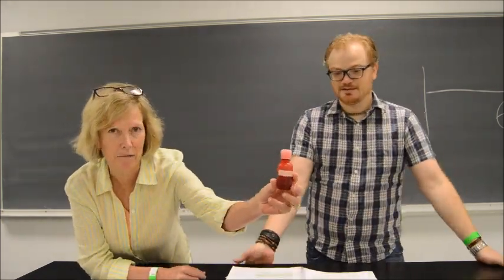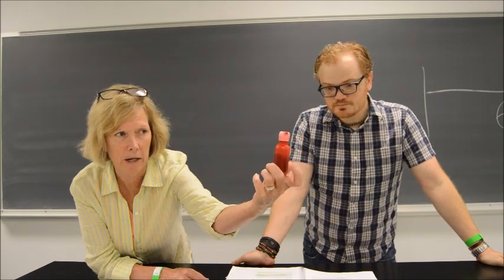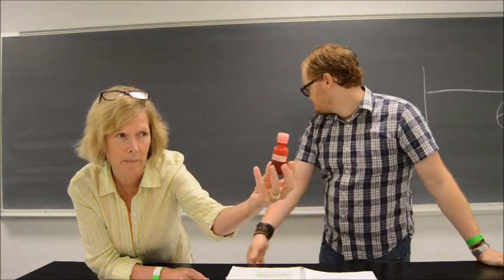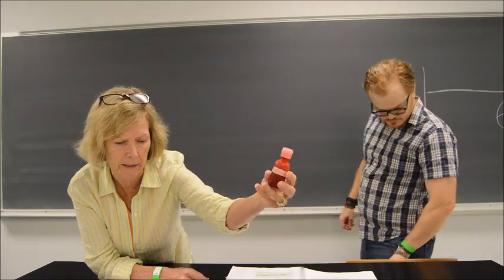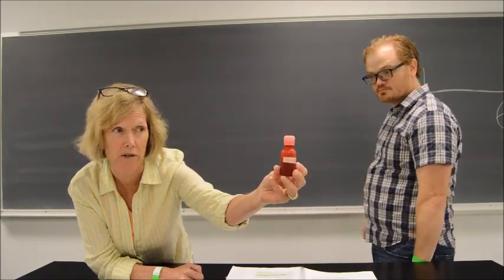Okay, so we have Sudan 4. I think y'all can see that. Notice this is a red solution, okay? So a little different color than you saw with the Benedict's reagent and the iodine for the starch test.